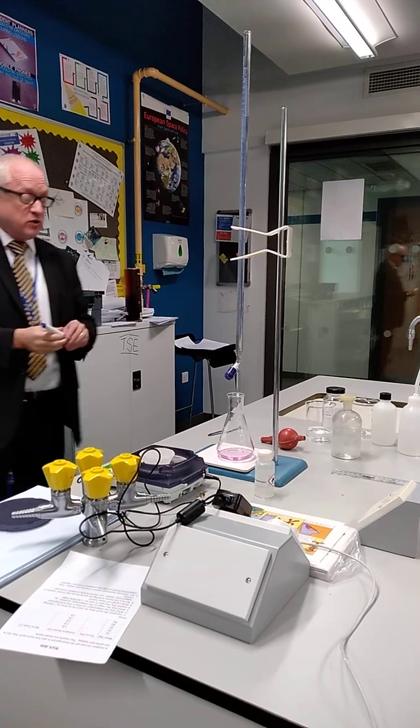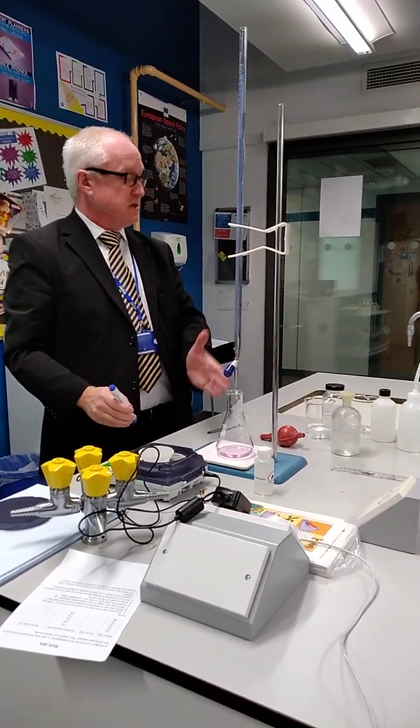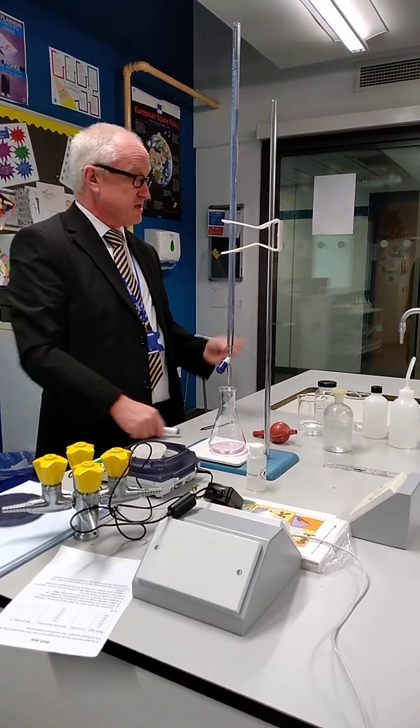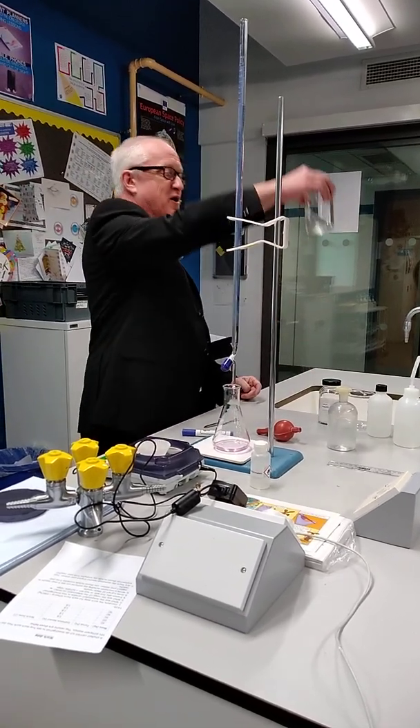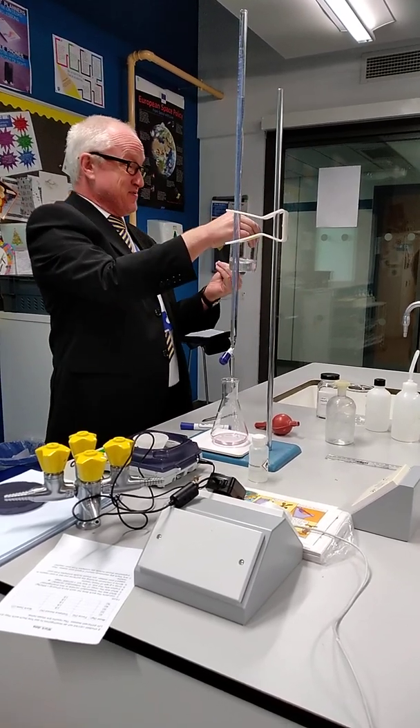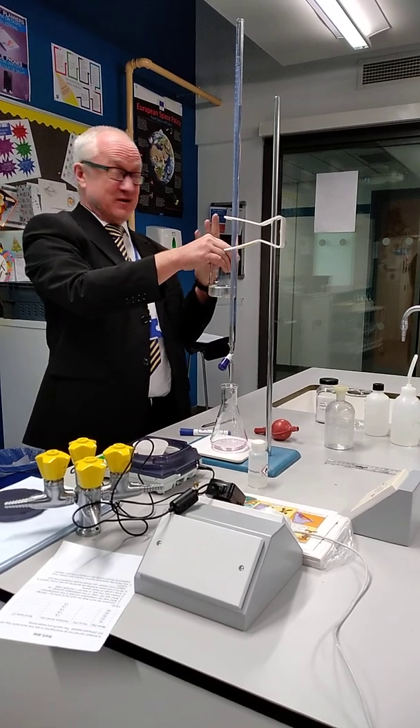Now I've got a value, I can do it again and keep on titrating until I get concordant results. Bear in mind you've only started off with 100 cubic centimetres of this, so the maximum number of titrations you're going to get is four.